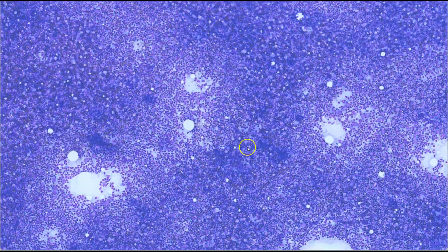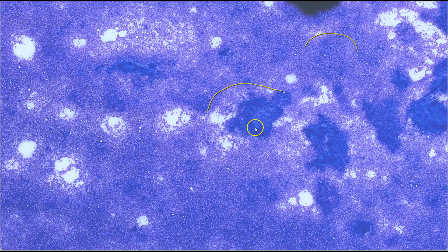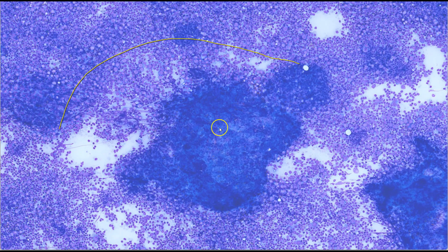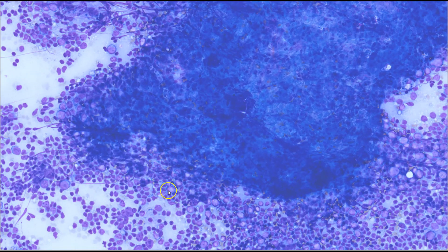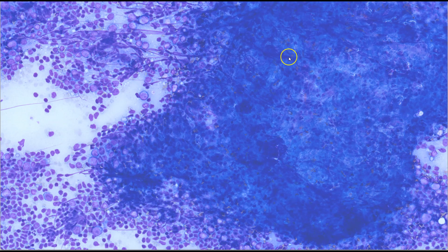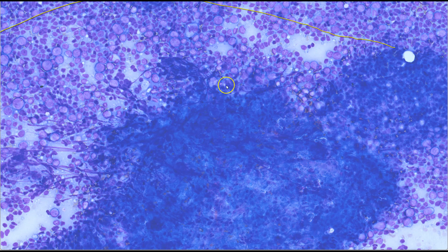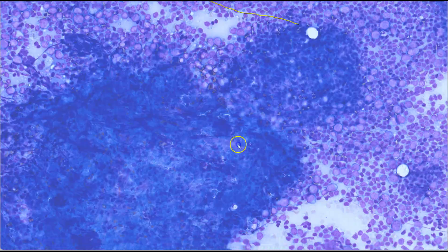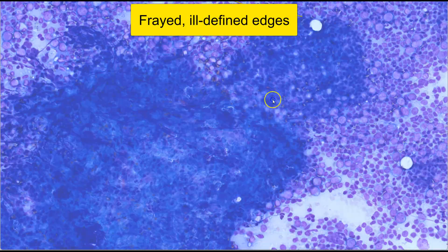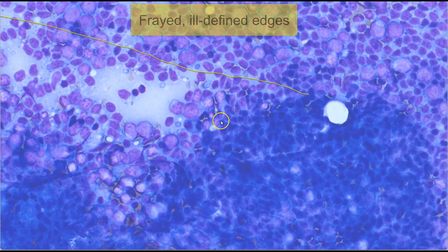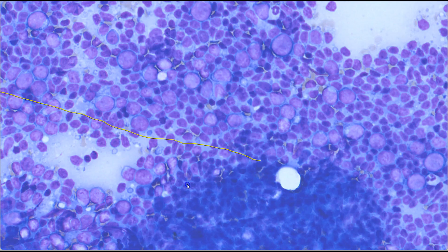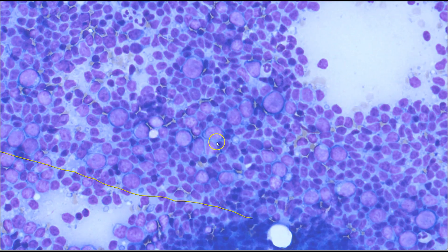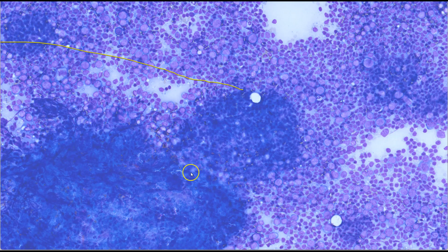We have a mixed lymphoid population, and now let's have a look at some of the tissue fragments. These tend to be quite thick, and it would be useful to focus up and down using the microscope, but in this instance we are not able to do that. So let's look at the edges of these tissue fragments, as this is where you will have a good clue as to the type of cells. We can see that the edges are not very sharply demarcated — in fact, they look somewhat frayed and loose. If you look closely at the edges, the cells are actually exactly the same as the dispersed lymphoid population. This tells us that we are looking at lymphoid aggregates rather than cohesive sheets of malignant epithelial cells.